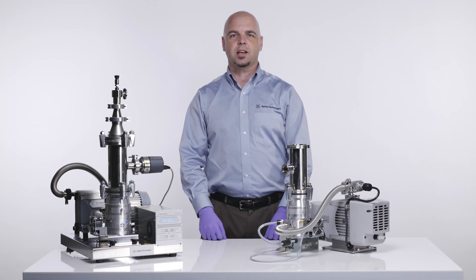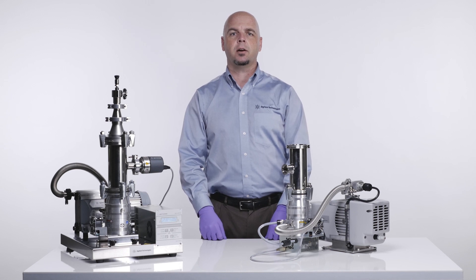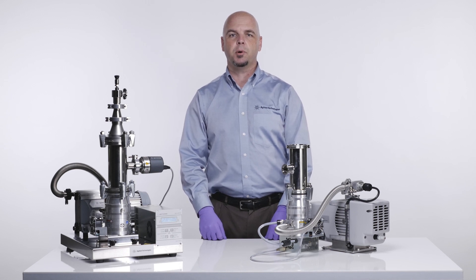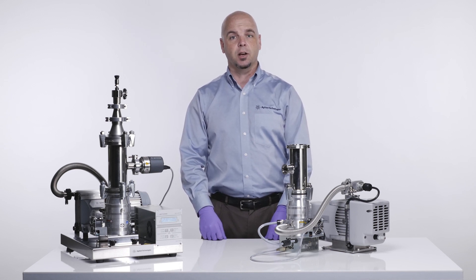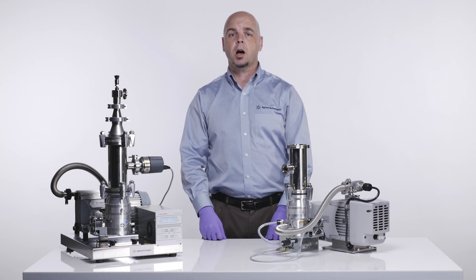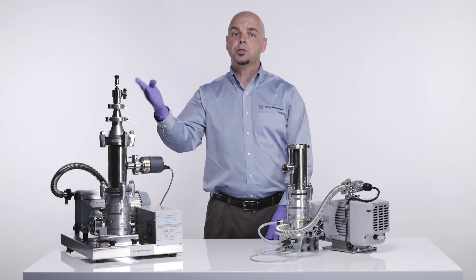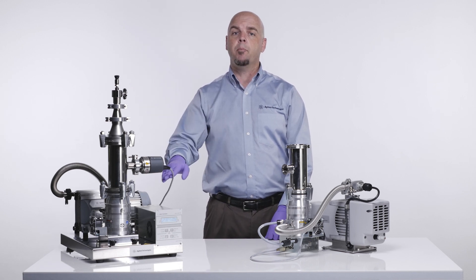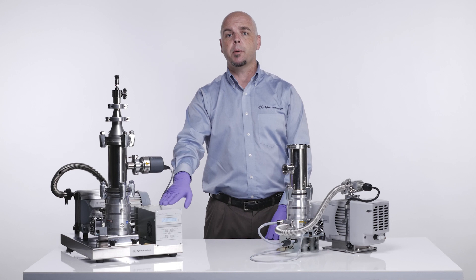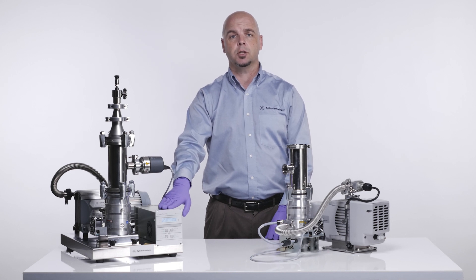Welcome back to Agilent Technologies video series on care and use of a turbo molecular pump. In today's video we're going to talk about adding a gas load to the turbo pump itself and monitoring the power, current, and voltage.